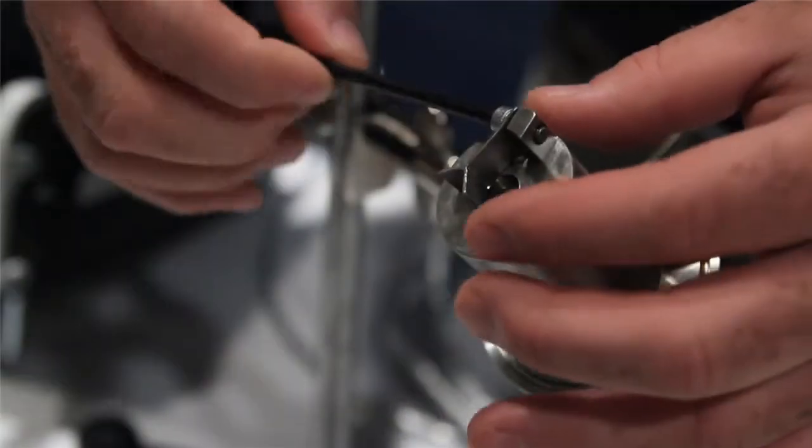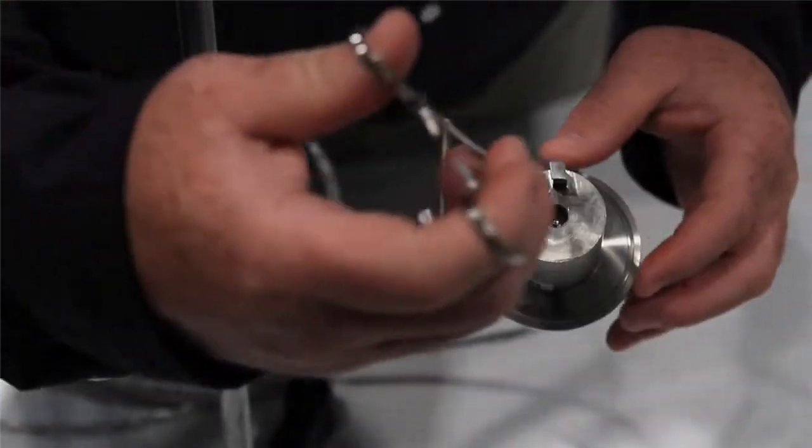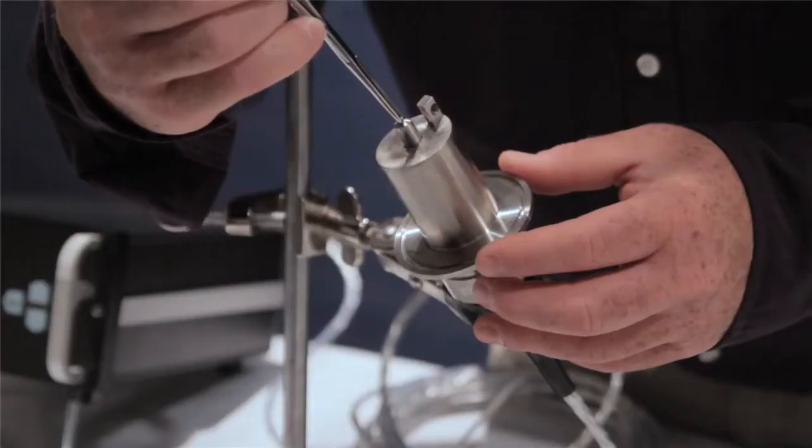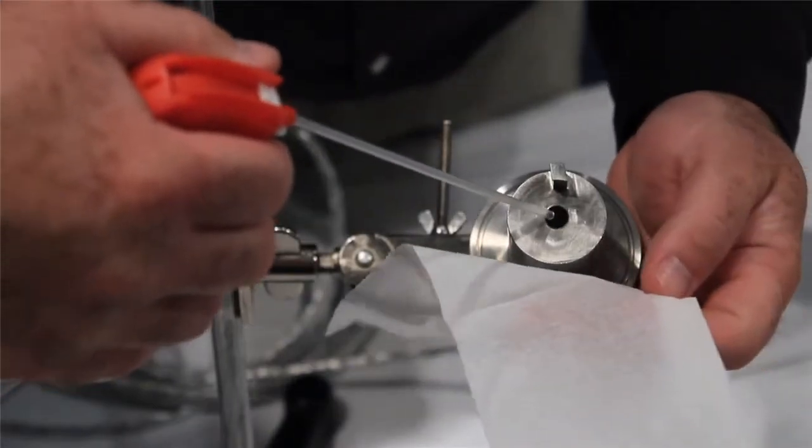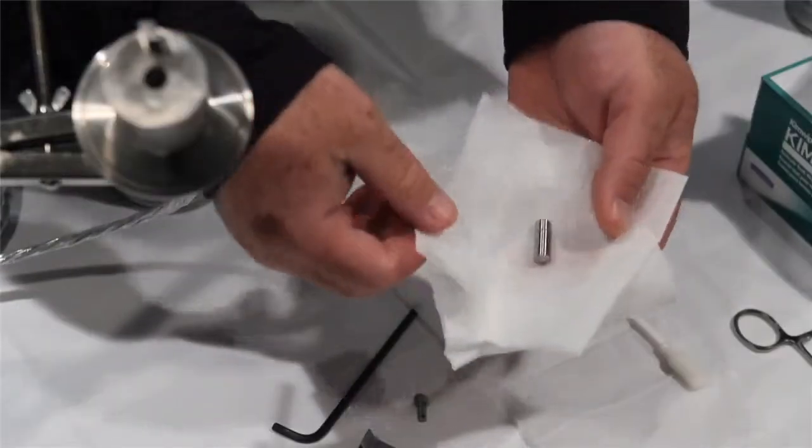We have now shown you how to clean the 311 sensor. This method applies to all 300 series sensors except the 372 and 374. Cleaning is the most critical step for viscosity measurement verification. We will now show you how to verify the sensor's viscosity measurement.